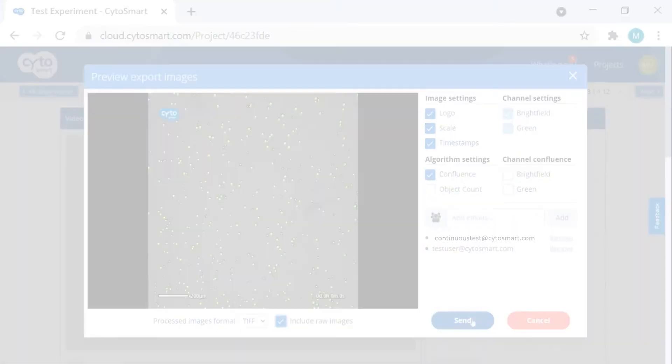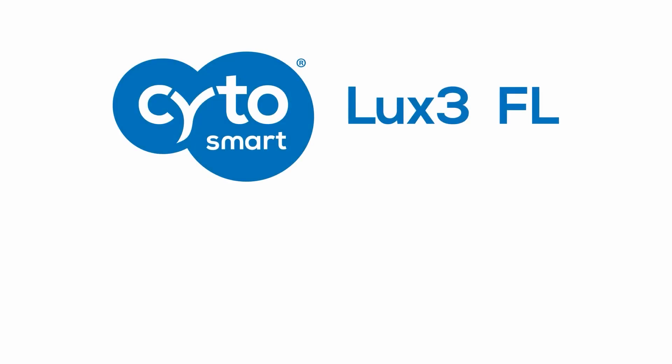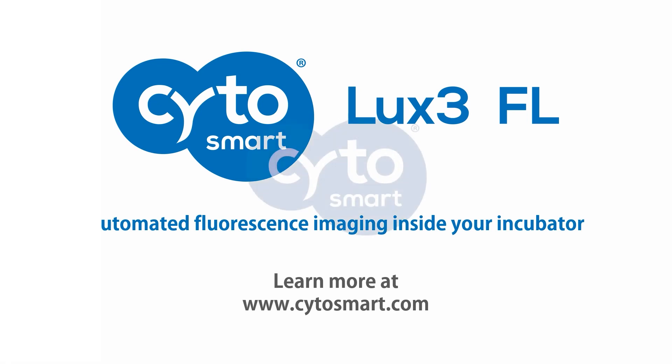Enjoy comparisons of your fluorescent imaging experiments with the Cytosmart Lux3FL Duo Kit and Multi-Lux3FL.